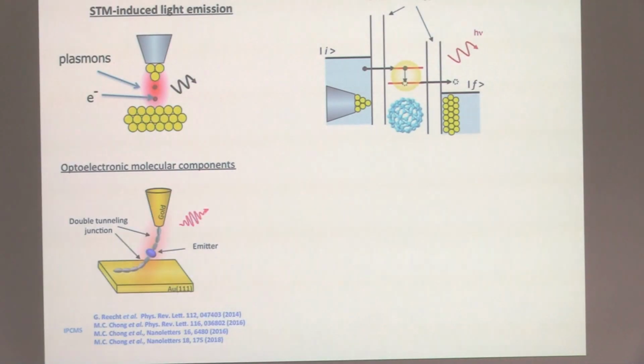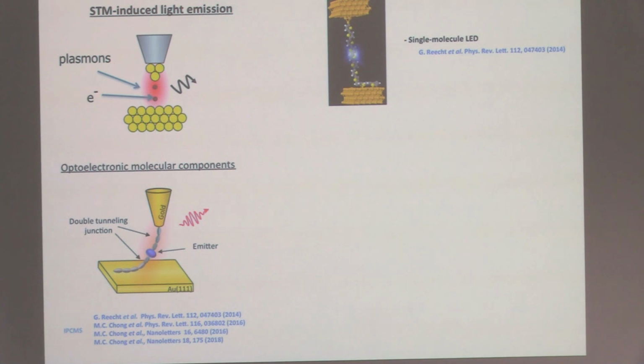And that's something we try to do. I will be relatively fast with this, but just to give the flavor of it. We work with polythiophene, another molecule we have seen before, that we deposit on the surface. We were able to make them on the surface, contact them with the tip, and lift them into the junction. And we ran a current through this molecule.